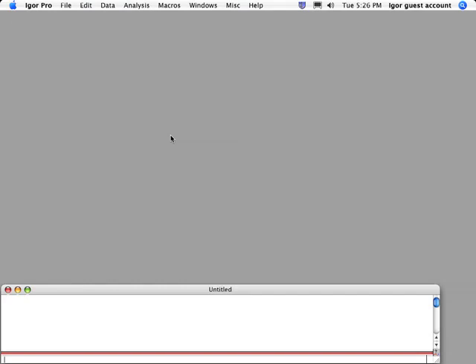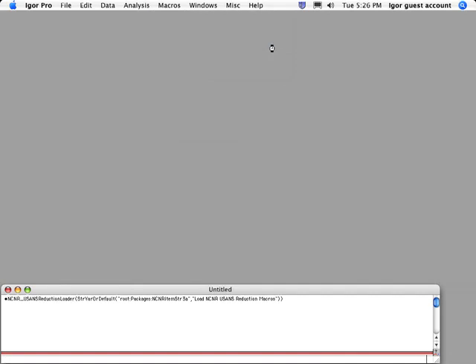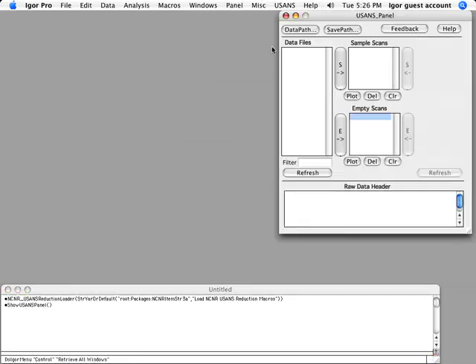This movie will guide you through the steps required to reduce and plot USANS data. To start a USANS reduction session, select from the Macros menu, Load NCNR USANS Reduction Macros. The procedures will compile, and you'll be presented with a main USANS control panel.